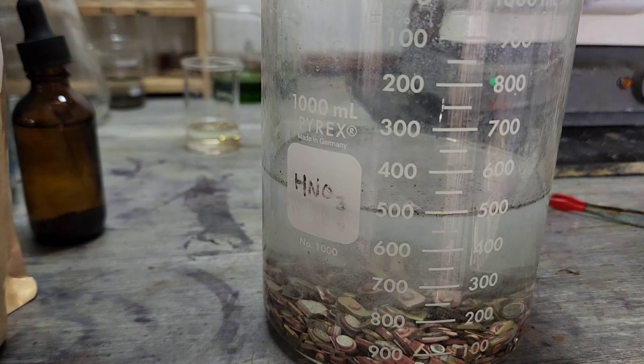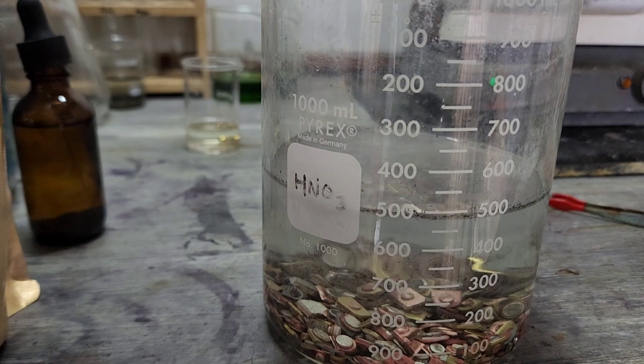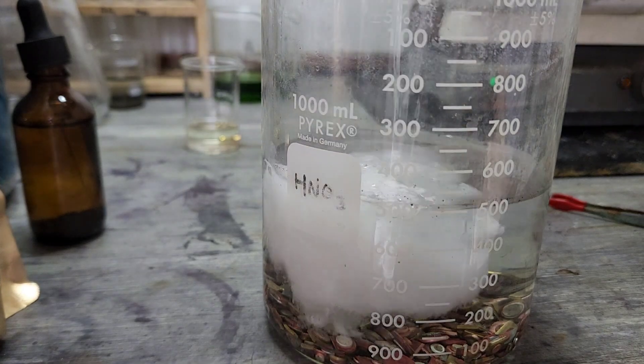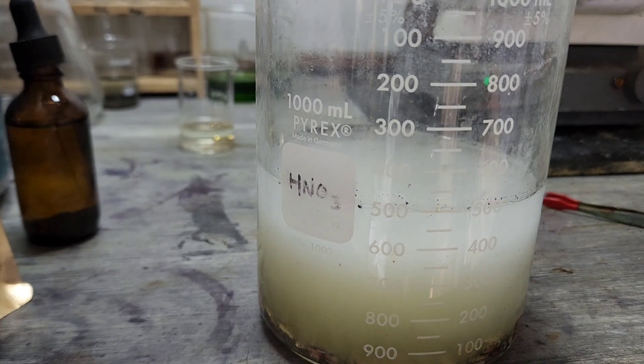Let's break out our potassium nitrate again. Let's go with one scoop. Looks like we got a pretty good reaction right off the bat.